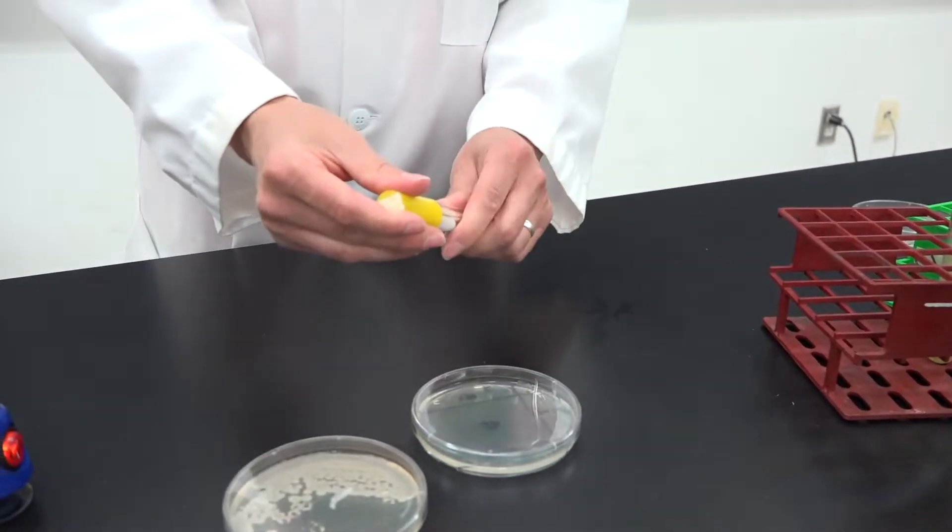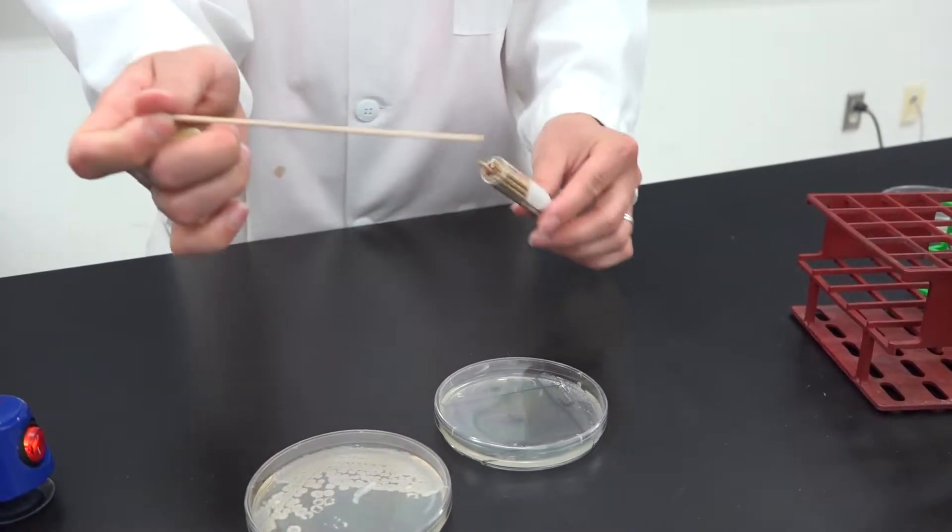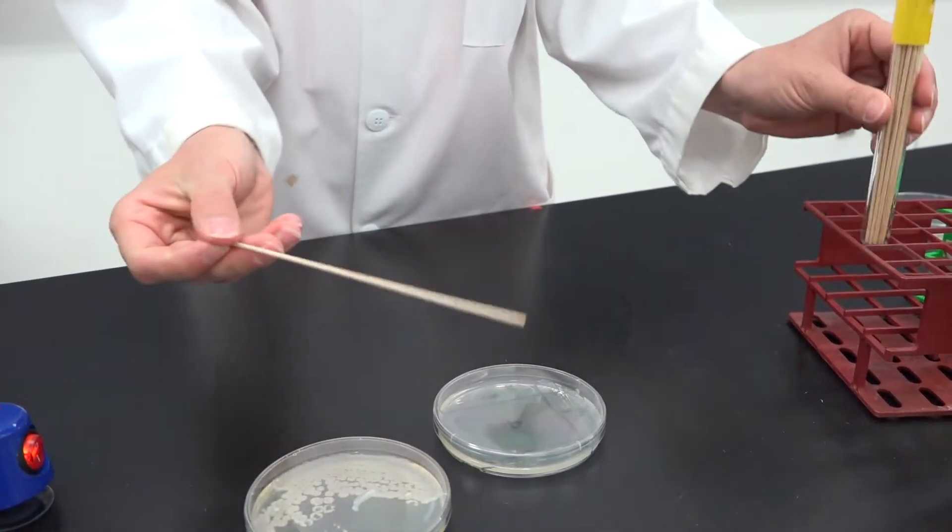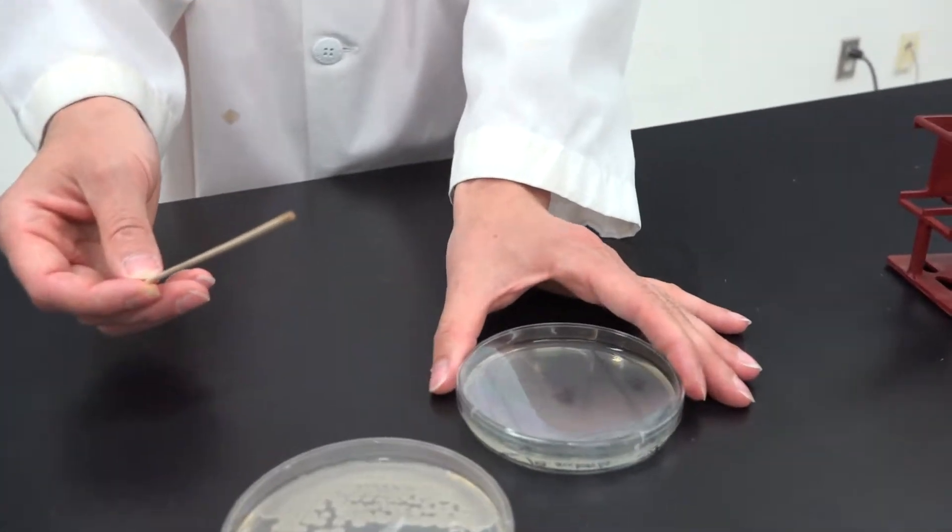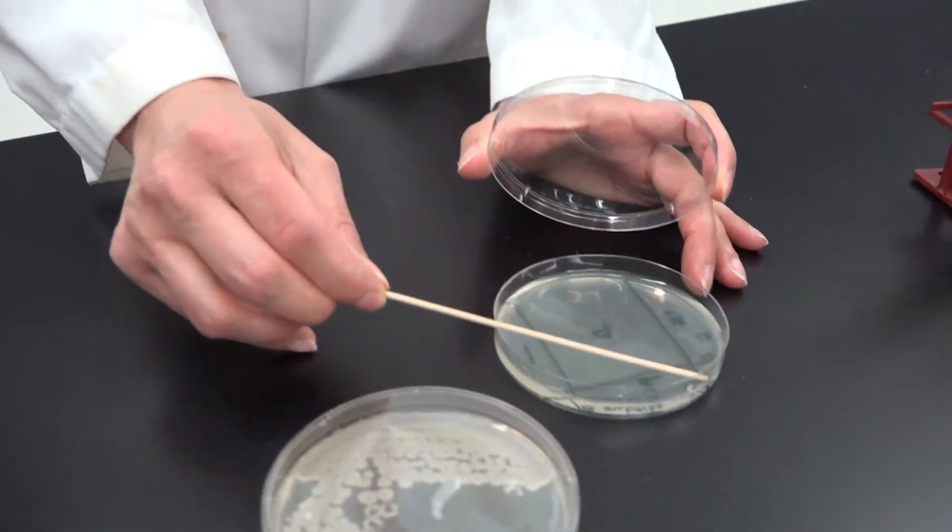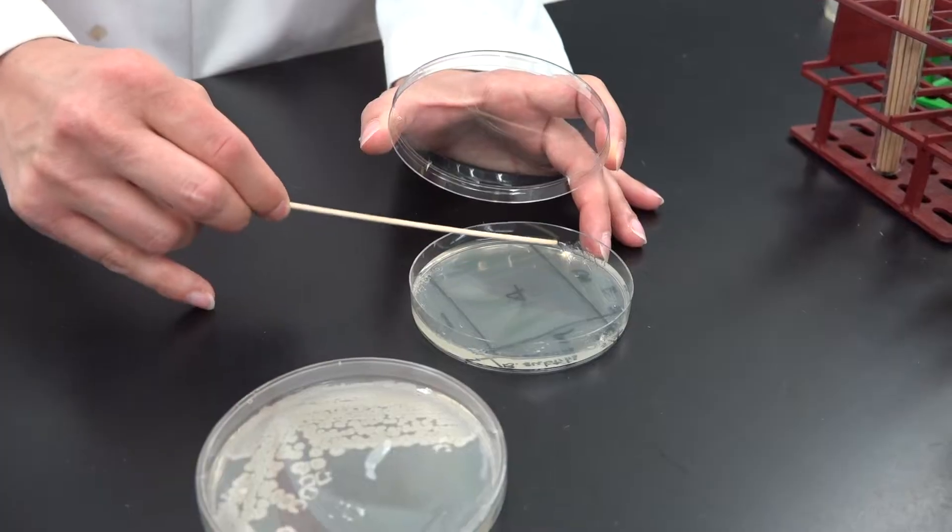Retrieve a third sterile stick from the tube, turn the plate 90 degrees, and spread the bacteria from quadrant two into quadrant three. Be sure not to press too hard so that you don't tear the agar.